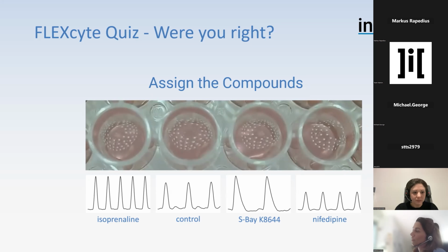I think it is always important, because what we do in preclinical drug development screening is we look at actually the three of them. We look at the electrophysiology, we look at the calcium transient, and we look at the contractility. And personally, I think the contractility gives you the best view, because the contractility is at the end of the whole chain of this whole motion of cycles. So whatever you see on an electrophysiological level, you see as a contractile answer. What you see on calcium level, you see in the contractile answer. The other way around wouldn't work.